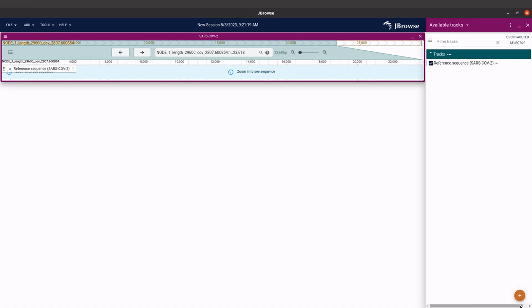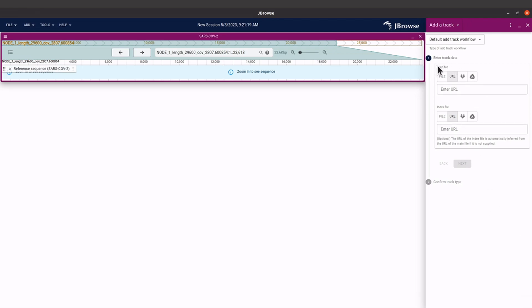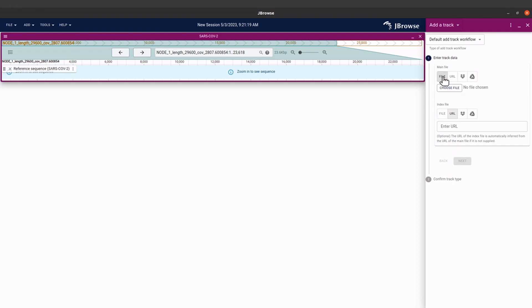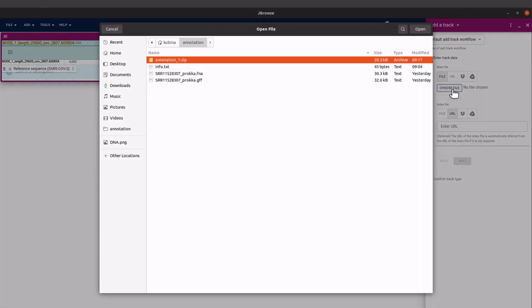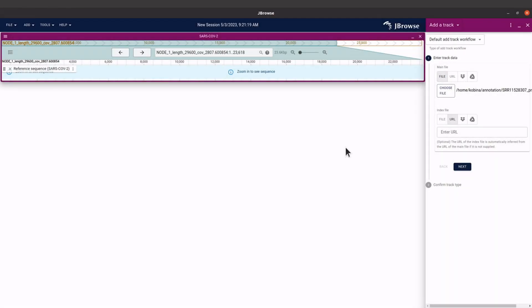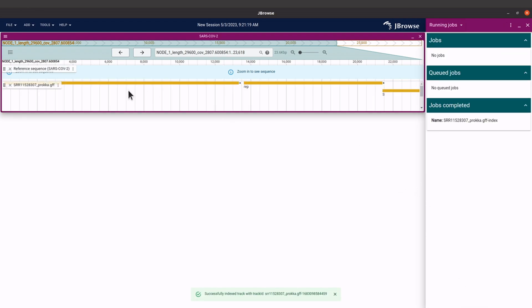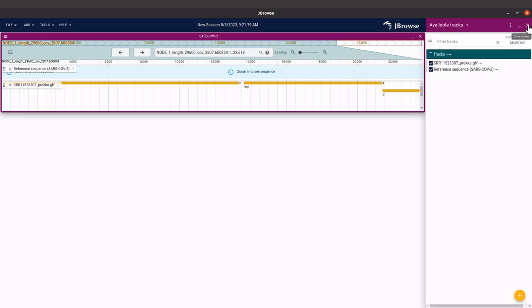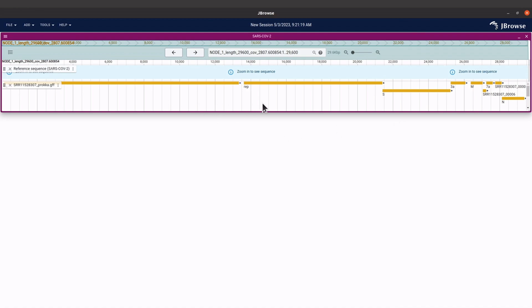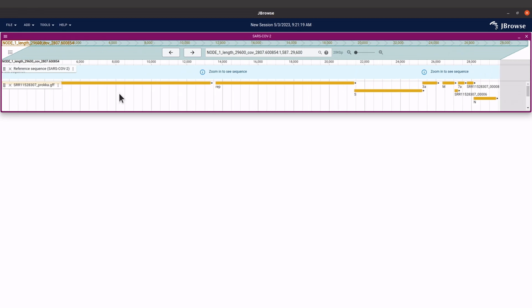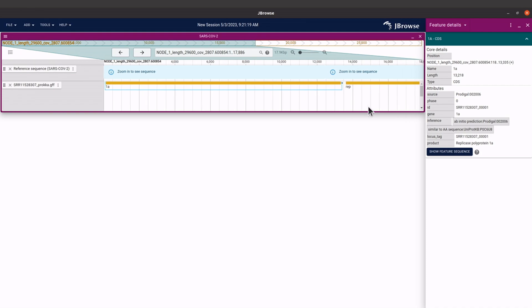A panel opens on the right side. Check the reference sequence track — that's the FASTA file labeled as Reference. The name will appear in the viewer. To load the features, click the plus button at the bottom, select Add Track, click on File, then Choose File, and select your GFF file. Click Next, leaving the defaults, scroll down and click Add.